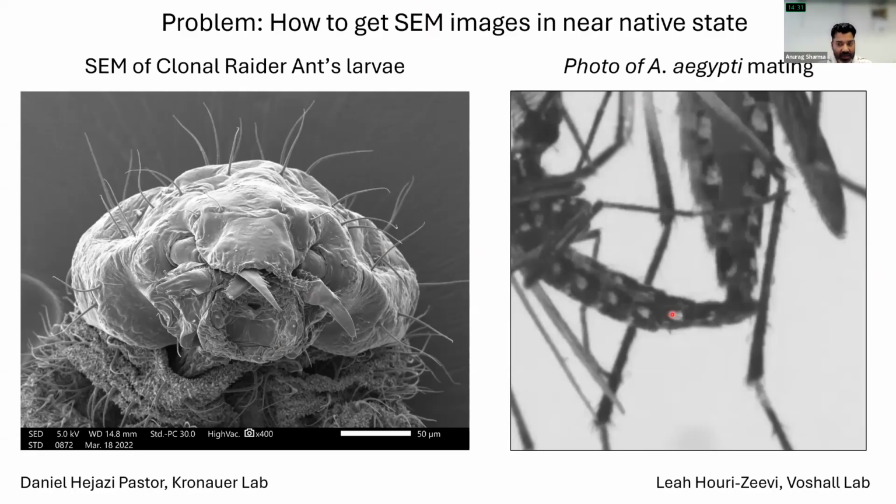First of all, it's very hard to get the mosquito in the mating phase because the mating lasts only 14 seconds. That's too little time, and it seems next to impossible to capture the male and female in the act. So Amalia and I had to brainstorm, and we thought, why not freeze them if we can capture them in the act? If we could do that, and we have the cryo scanning electron microscopy, we can improve our results for these two things.